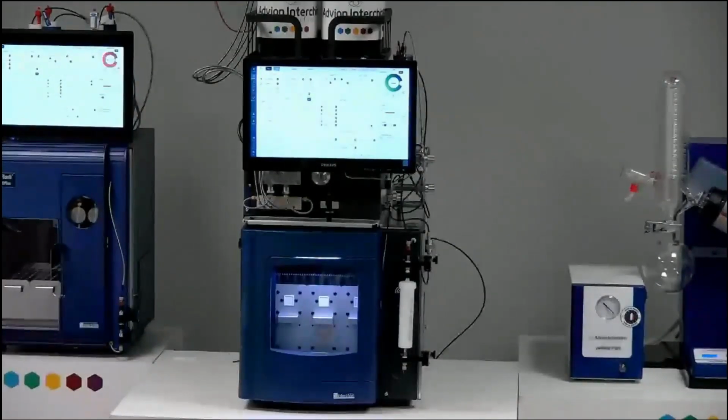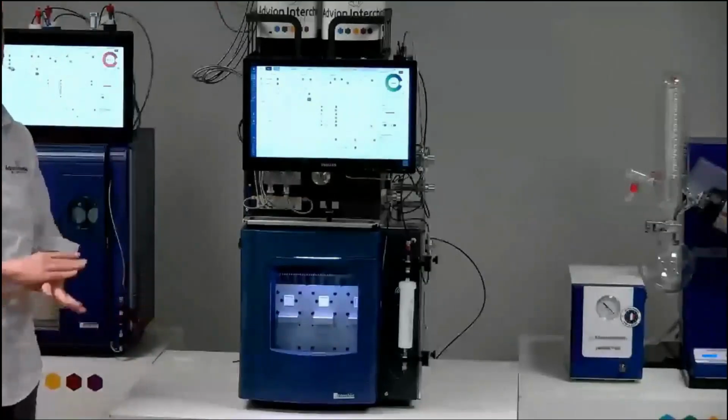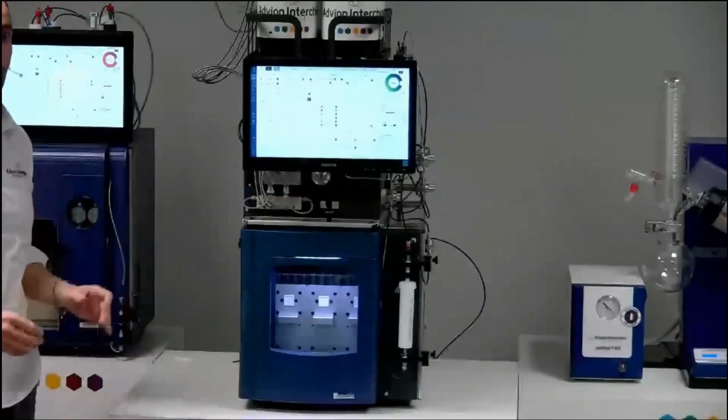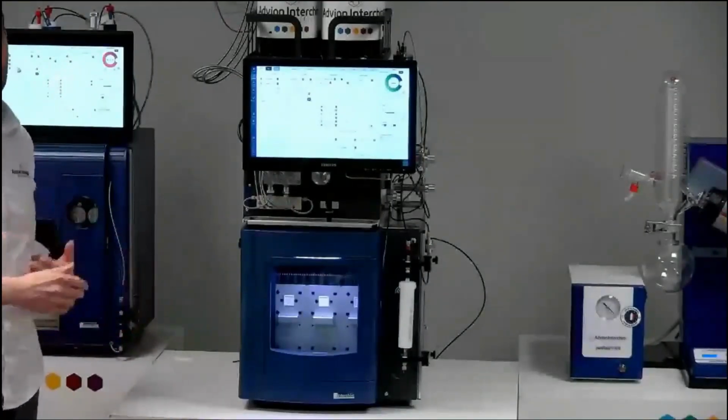But it's important that each time you have a problem on the system, we never stop the purification completely. We put the system on pause. You can solve the problem and restart the run.